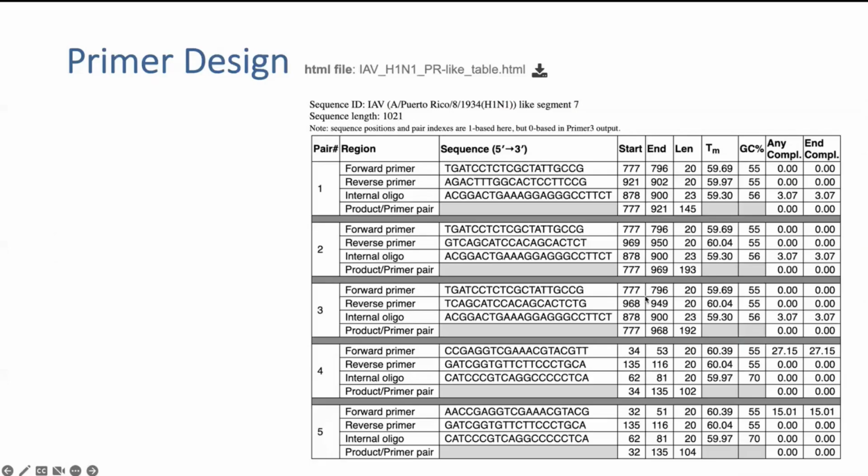You can also design primers if you want to go on to perform PCR or real-time PCR experiments. And this is pretty self-explanatory, but I can also go through it if anyone wants more details.